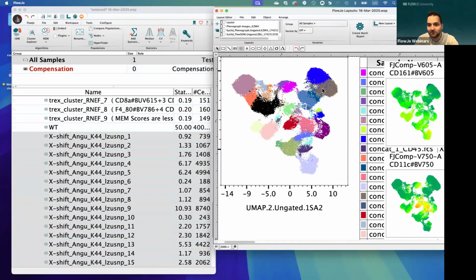That's much, much better than traditional gating or any kind of gating. You see how nicely it also localizes with the UMAP and separates everything into different clusters. And that was also a spot, remember, where I placed the gate and supposed it was one population. It's actually two, maybe even three here. So we really need to be careful and use the appropriate tools for exploring that.